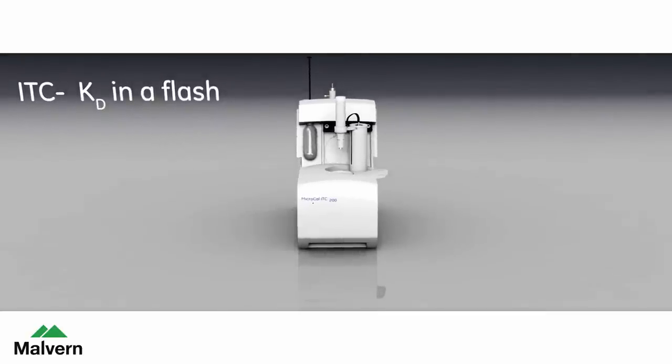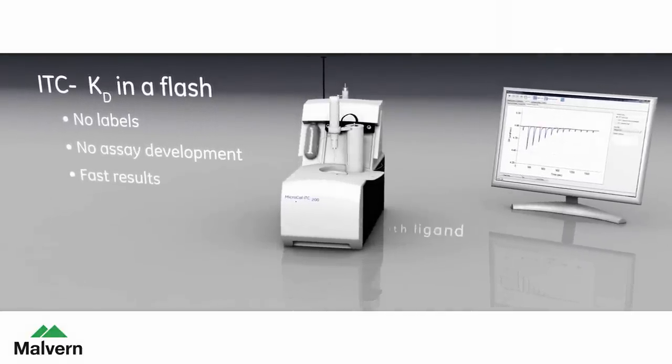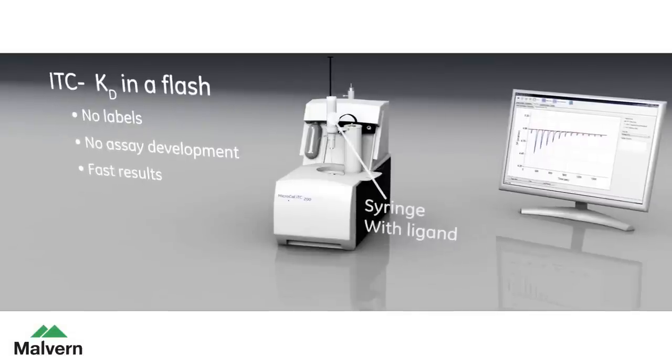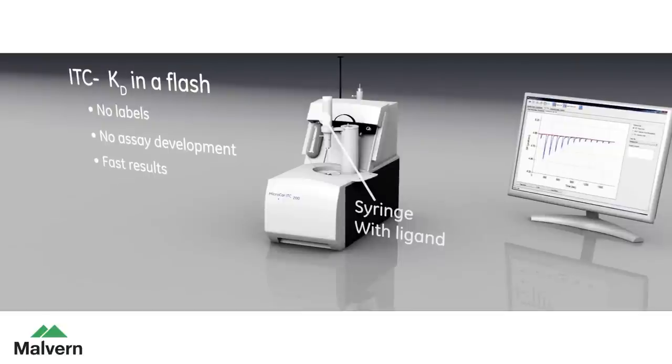Microcal ITC 200 is designed for ease of use and exceptional sensitivity. Cell filling, injection and cleaning is semi-automated and handled through the syringe. Let us show you how it works.